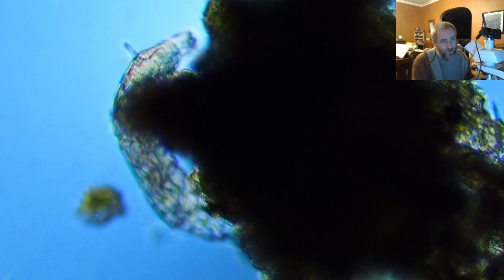And you can see this one's got striations on its midsection right there. Yeah, that's a rotifer, and you can really see the antenna quite well. You can see how they clamber around, and on the back end, they just have one little foot. Again, they're kind of like a sleeping bag with one little claw at the end.